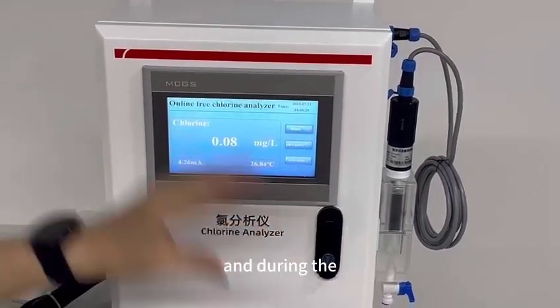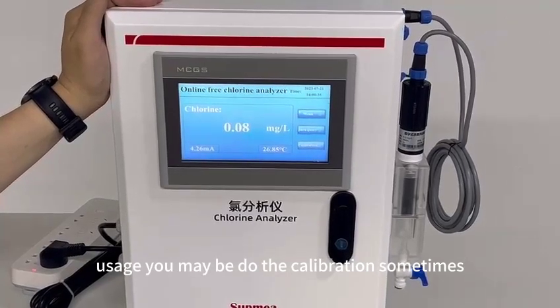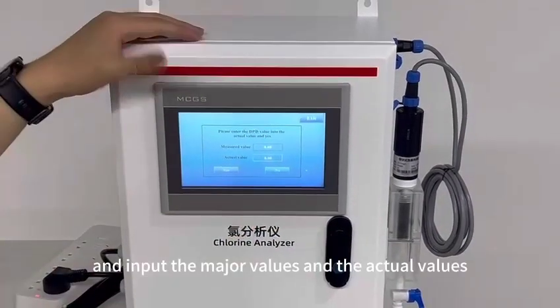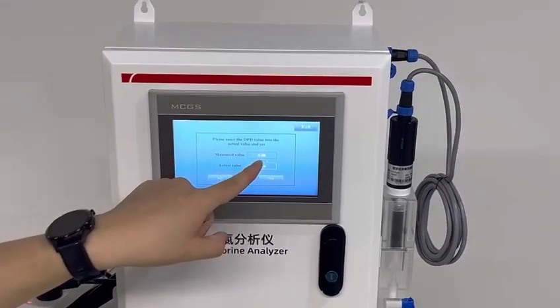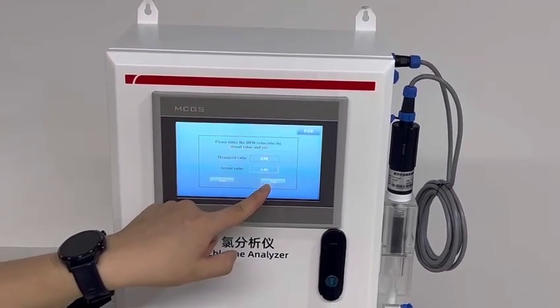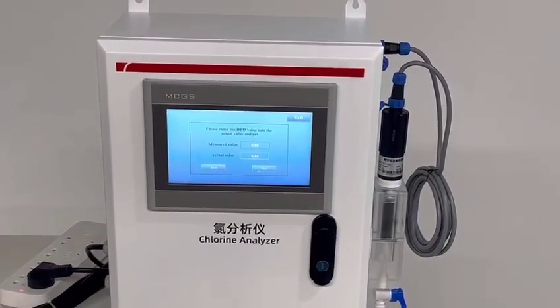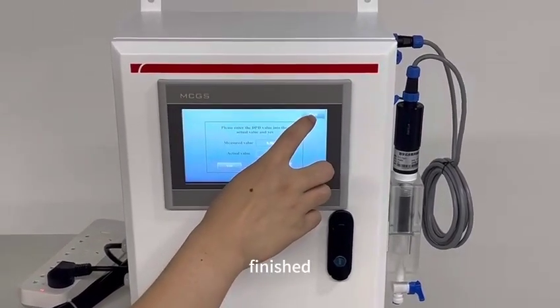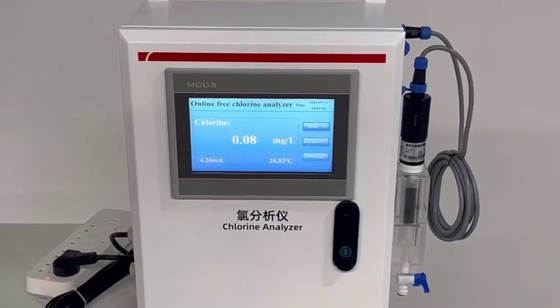During usage, you may need to perform calibration sometimes. It is very simple: just click Calibration, input the measured values and the actual values, click Yes, and wait a few seconds for the calibration to complete.